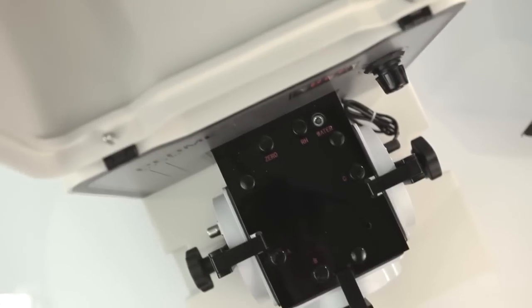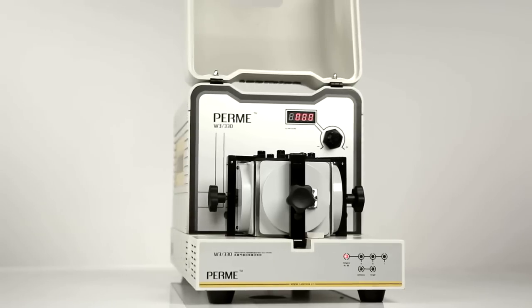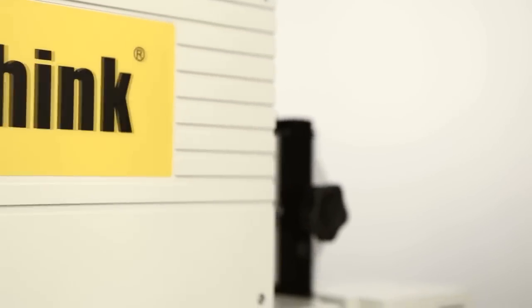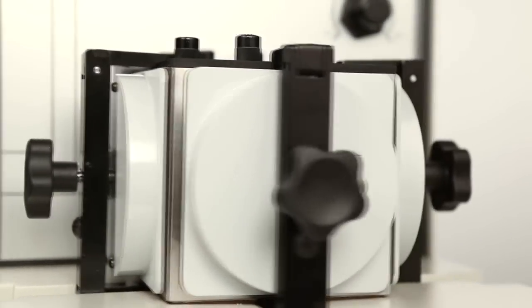W-3-3-0 is LabThink's latest generation of automatic WVTR testing system. It adopts an integrated test unit with three vertical cells, which is a patented design of LabThink.